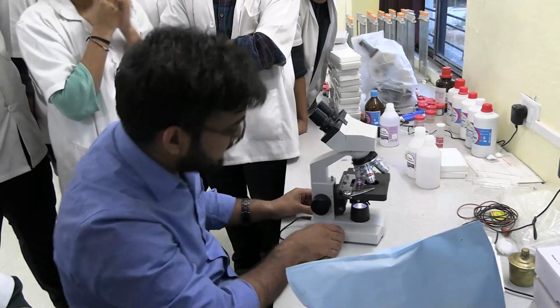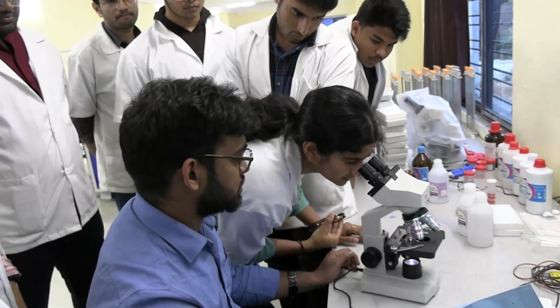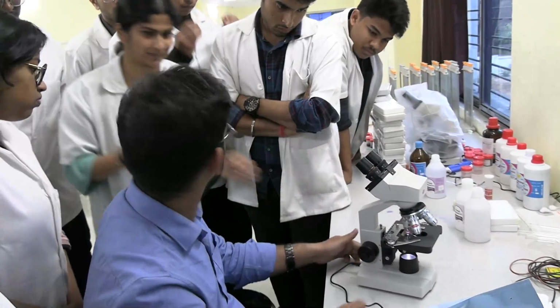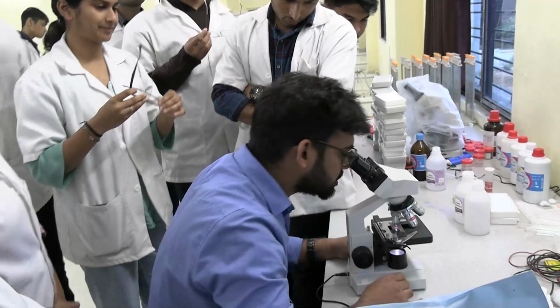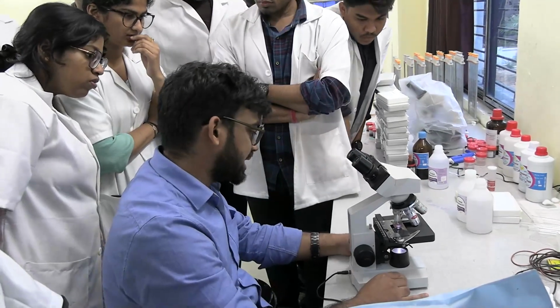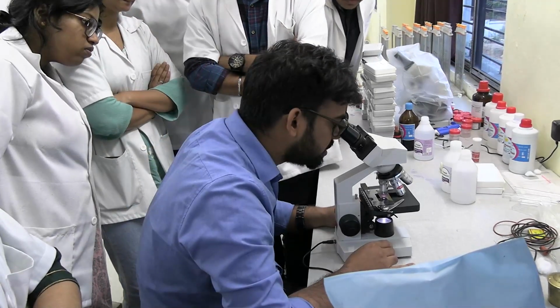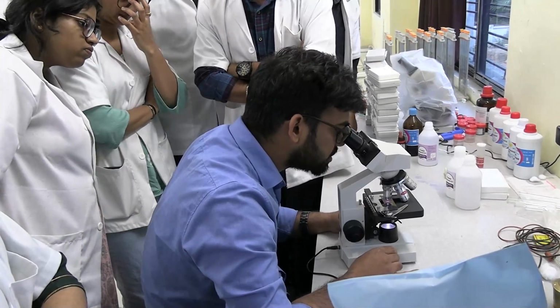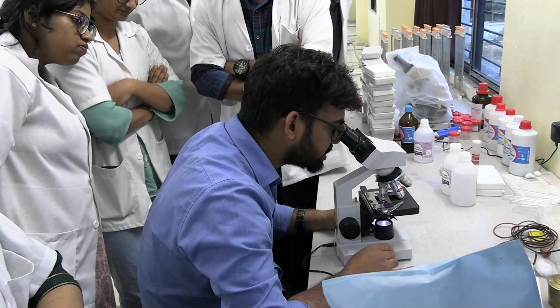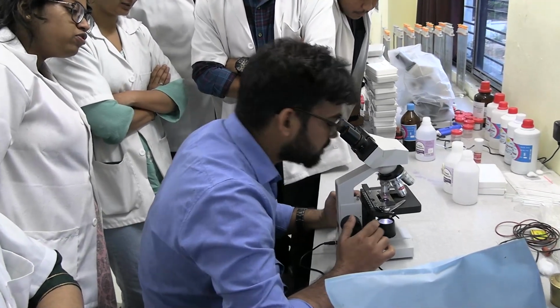See, in 10x I have found that. You can see the RBCs. Suppose I'm going to look at a place now. What is this? This is the slide. Stages. Very good. Suppose I have to sit here. Now I am going to go to the next.